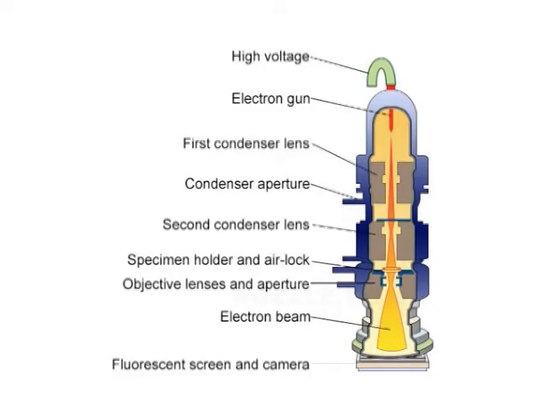Coming to the principle of electron microscopy. Electrons accelerated to a particular potential possess the same wavelength, which constitutes a more or less monochromatic beam. The beam of high energy electrons interacts with the specimen within a certain area of cross section depending upon the electron beam energy. An accelerated electron penetrates into the electron cloud of an atom and its path is deflected, causing it to scatter at an angle.